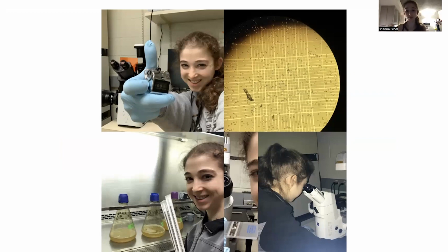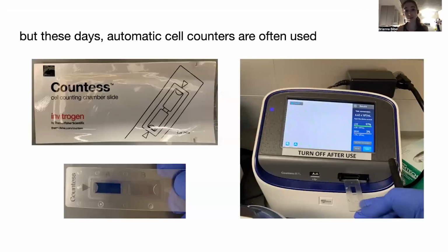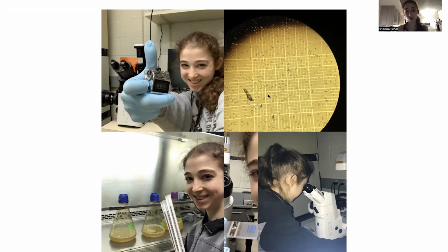It's just through capillary action, basically, because the water is attaching and it just gets pulled in. It's not like there's anything electronic pulling things in, but it'll just kind of go in. And then on this hemocytometer, there are these grids, and you count the number of cells in each of these grids using some sort of cell counter to help you keep track. Then you are able to count the number of cells and do the math.